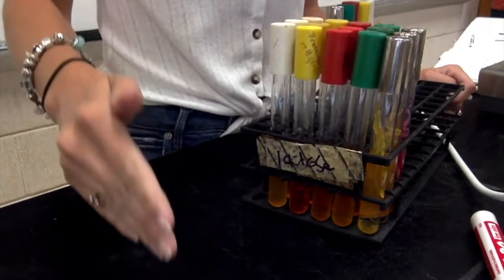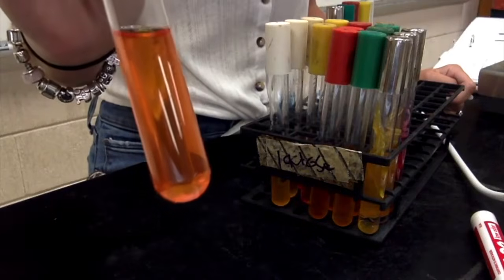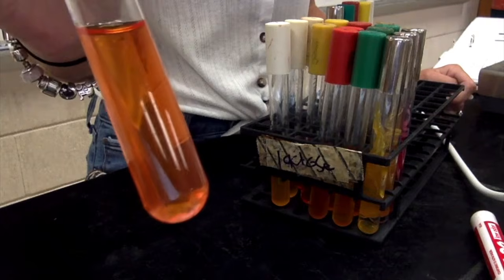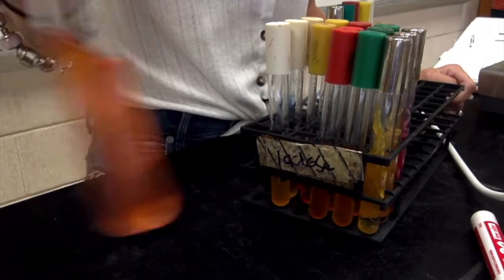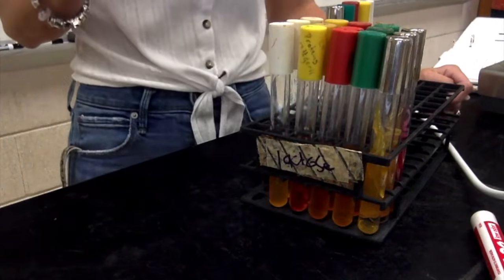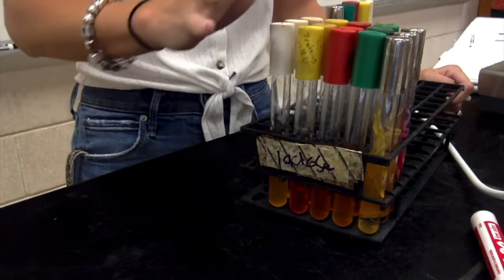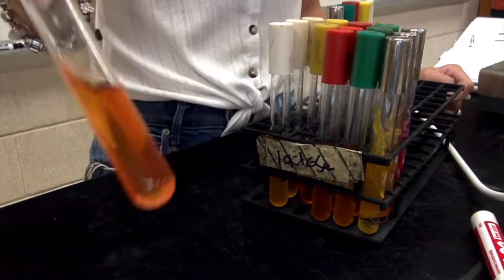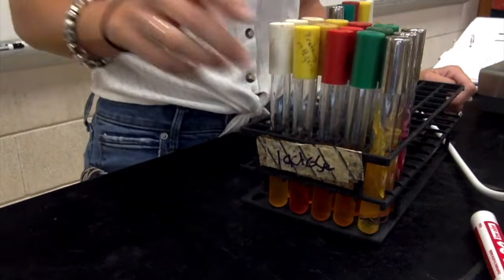Here's my glucose tube. Yellow, so that's positive for fermentation with a gas bubble. So positive with gas. Sucrose, which is the yellow cap, is a negative reaction. That is a red tube, negative reaction. In our TSI, remember the three sugars that were there: glucose, lactose, and sucrose. Well, it can ferment the lactose and the glucose, but it clearly cannot ferment sucrose. So E. coli does not have the ability to ferment sucrose.